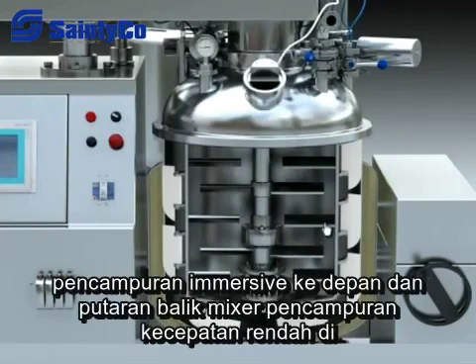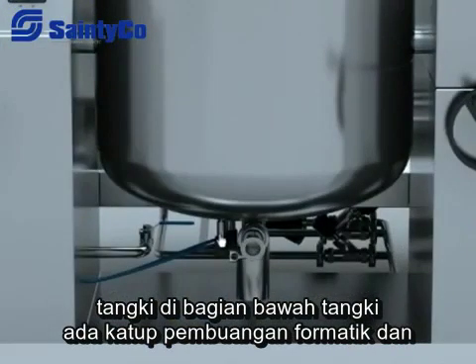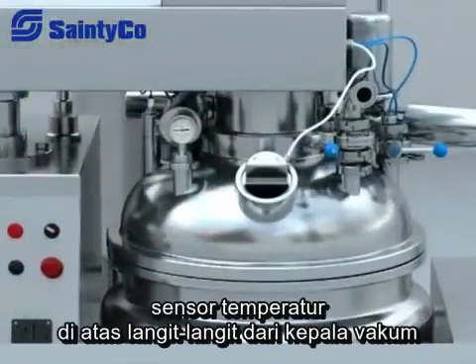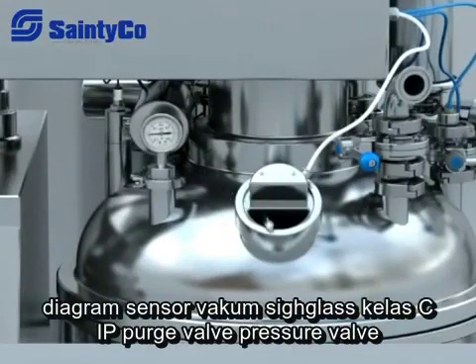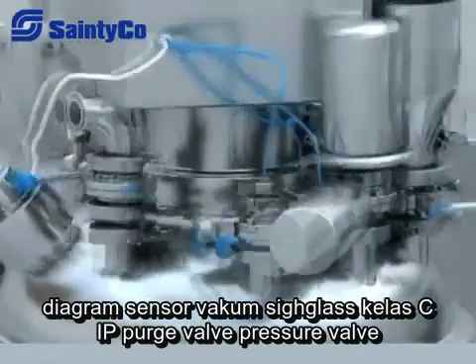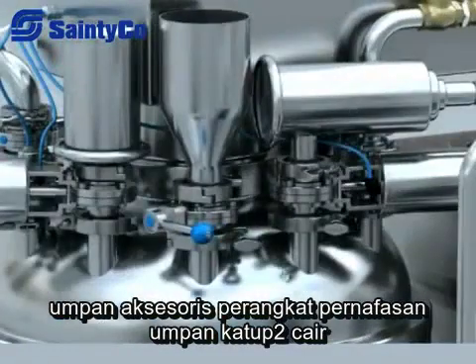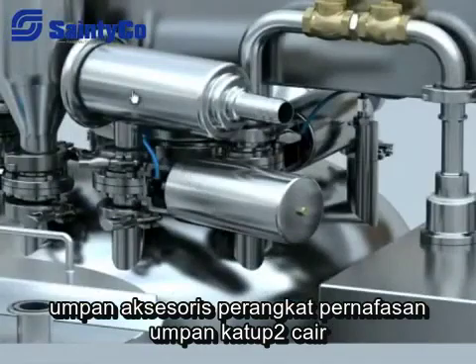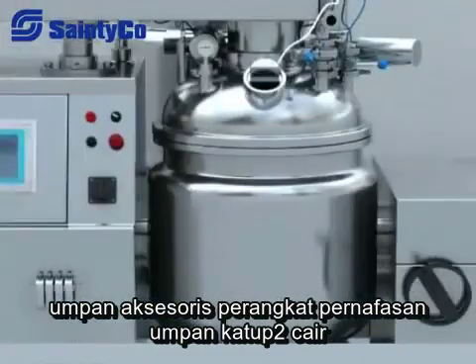There is a high-speed emulsifying mixer and forward and reverse low-speed mixing device in the tank. At the bottom of the tank there are a pneumatic discharge valve and temperature sensor. On the upper ceiling head there are a vacuum sensor, diaphragm vacuum meter, sight glass, CIP purge valve, pressure valve, respiration device, accessories feeding valve, liquid feeding valve, and pneumatic valve for vacuum.